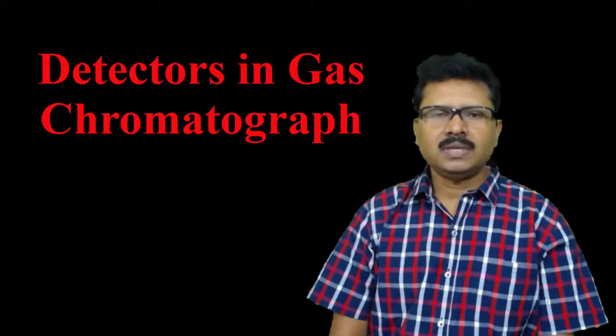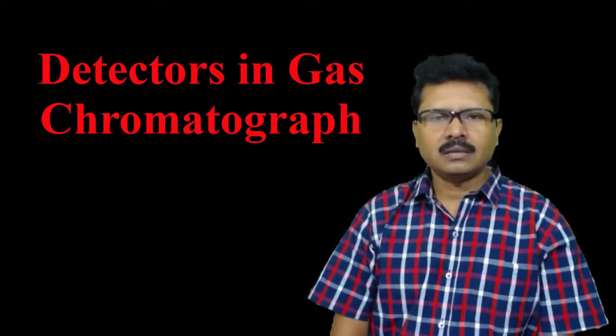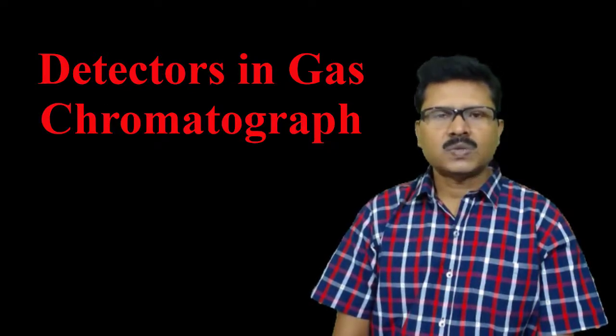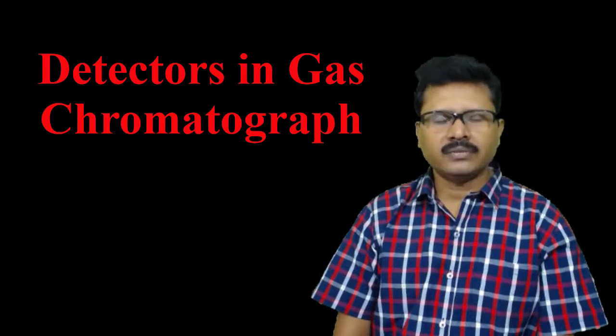Welcome to this tutorial. In this tutorial I am going to discuss different detectors used in gas chromatography. Gas chromatography is a technique for separating molecules from organic and inorganic compounds based on the properties or characteristics of volatility and polarity. In this case, two phases are there according to construction. One is the mobile phase, another one is the stationary phase.